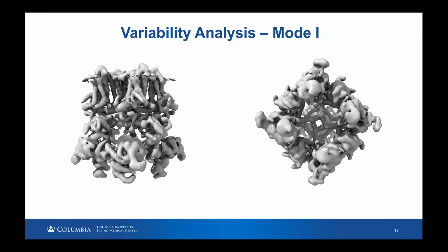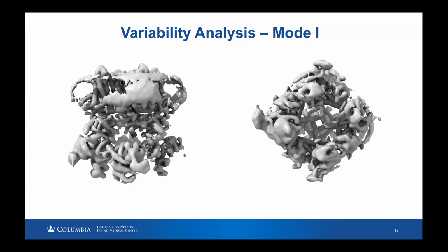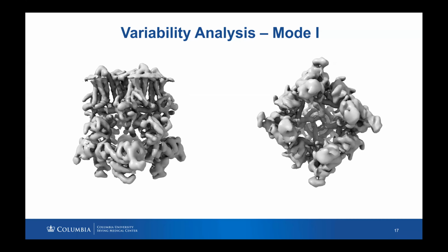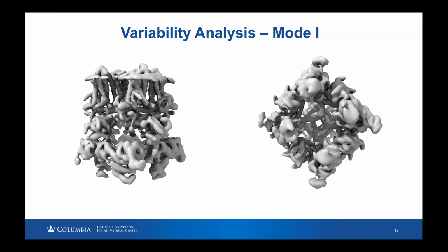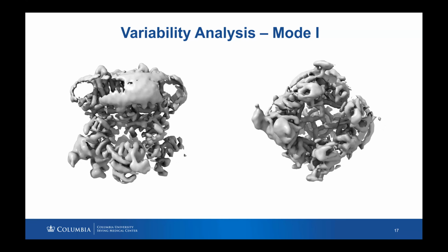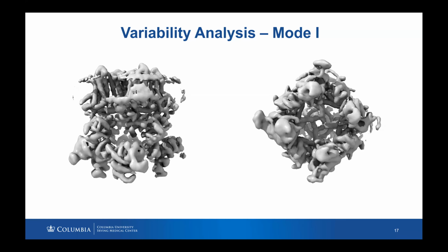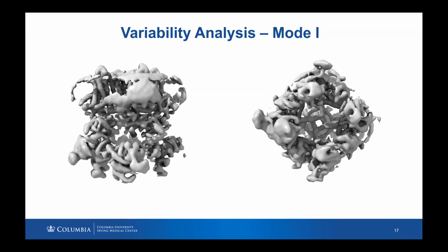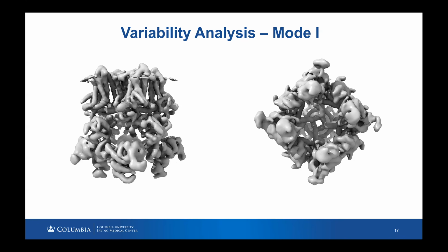Yeah, this is an excellent question, and I want to warn everyone who uses CryoSPARC and runs this variability analysis to get insight into whether you can see specific movements in your protein. In my experience, when we did 3D variability analysis in CryoSPARC, sometimes you got fake movements. Although we can see it flickering between two C2 conformations, like a diamond shape in the lower part, I'm still not sure whether they exist. I think this can be just an artifact of variability analysis.